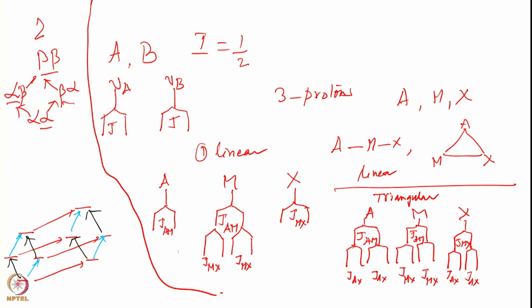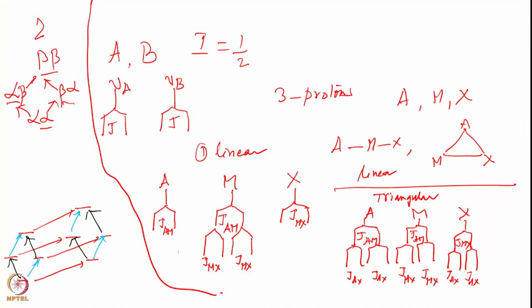This is how we draw the energy level diagrams, and such a kind of analysis is called first order analysis. You can simply draw the splitting patterns of the individual nuclei. If there are 4 couplings, of course you will draw more couplings. And a classic example of this is seen next. Before that, suppose any of these coupling constants are equal, then these lines will merge.